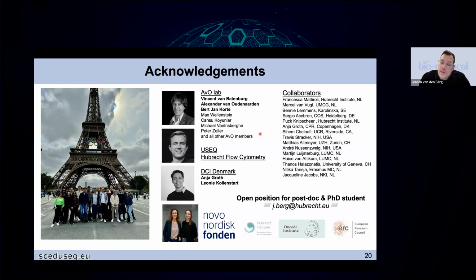That is due to the fact that we purify only DNA replication molecules from a pool of many different molecules, and then we sequence only those particular molecules.